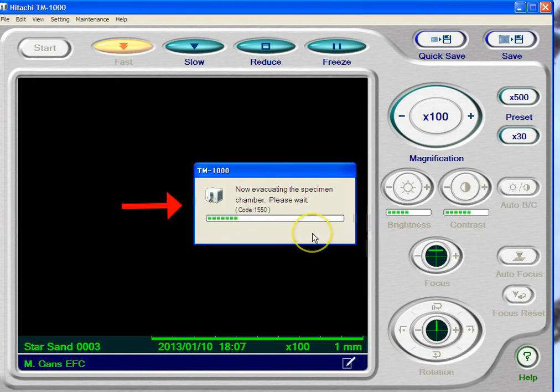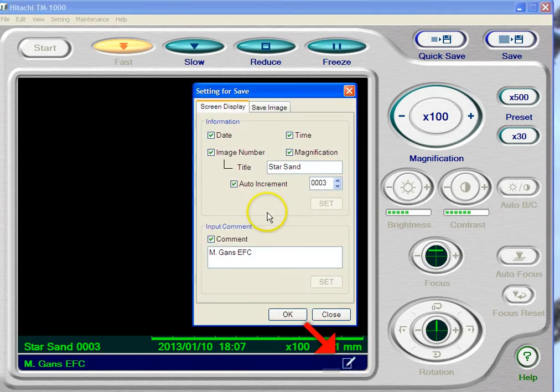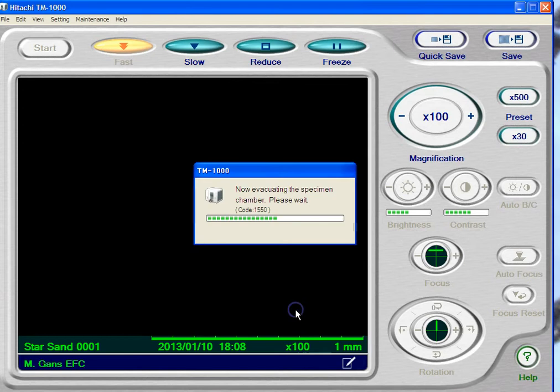You can see our message says 'now evacuating the specimen chamber.' While that's happening, we're going to click down here on the bottom on this little pencil, which allows us to label what the specimens are. In this case, it's star sand. You want to have auto increment checked. I'm going to reduce the number to one — the reason is every time we save a picture, it will give it that name with that number so you don't accidentally overwrite your images. I always like to put my name at the bottom. Hit set there and set here and hit OK. You can see this now has what we're imaging, your name, the date, the time in military time, magnification, and the scale for that scale bar.